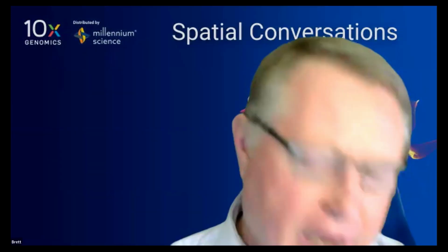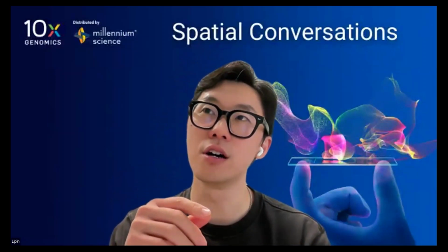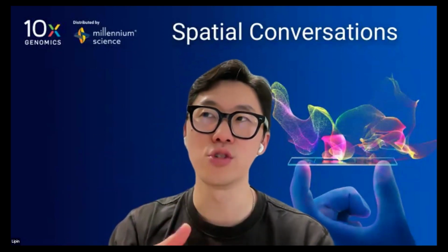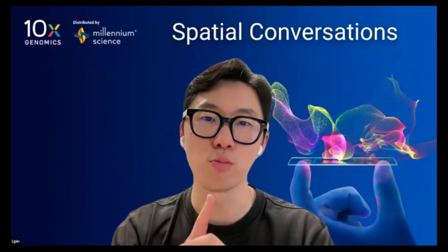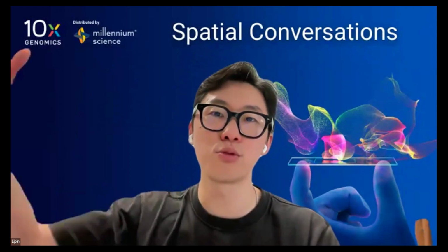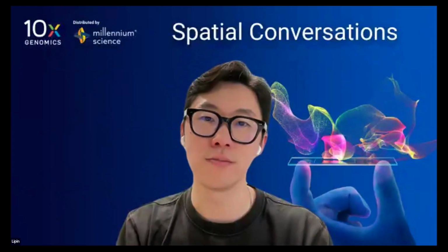Okay. And for Xenium, the mouse work you did with Xenium, how did that go? Oh, Xenium doesn't have that issue. I think a lot of the floating off issue is the repulsion of the probe on the slide, and with Xenium there aren't actually any probes on the slides. It's just a slide that allows you to attach your tissue, and then the probes come in on top of that for the imaging. So we didn't have any issues with the Xenium.